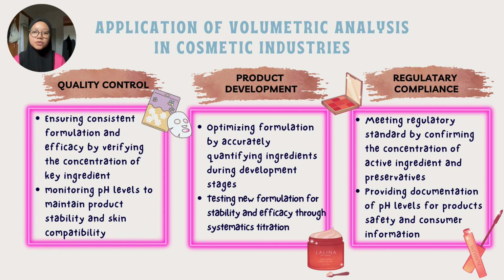The second one is product development. Optimizing formulation by accurately quantifying ingredient during development stage. Testing new formulation for stability and efficacy through systematic titration. The third one is regulatory compliance. Meeting regulatory standard by confirming the concentration of active ingredient and preservative, providing documentation of pH level for product safety and consumer information.